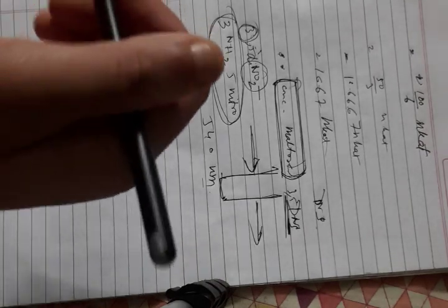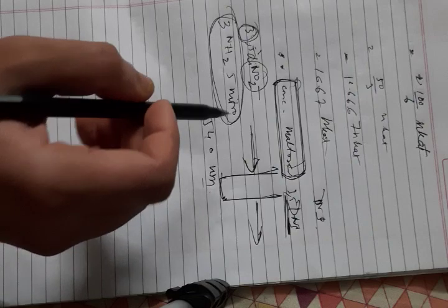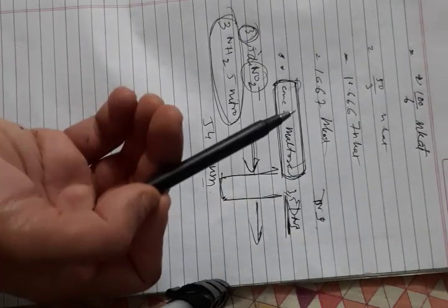So first of all, what do we need to do? Well, for what OD, what will be the maltose? How would we know that? For that, we need to do an experiment. At what OD, what is the concentration? So we need to make a standard curve.